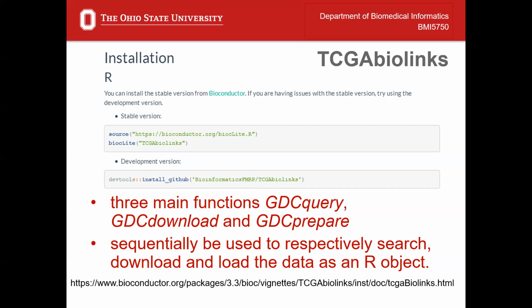But it's a little hard to modify for your own use. So I don't use it, but I've put together guides on how to use it, and they have a really nice website for it.